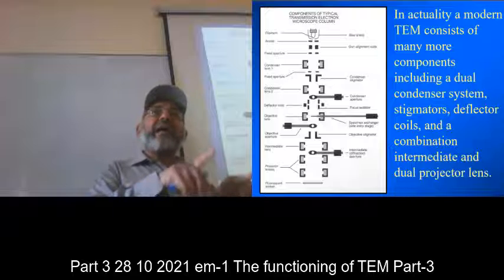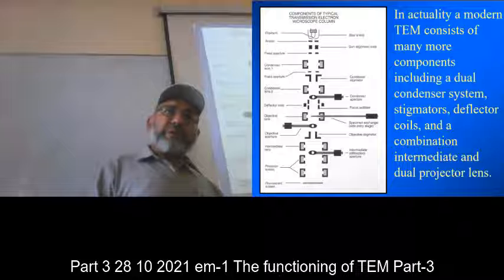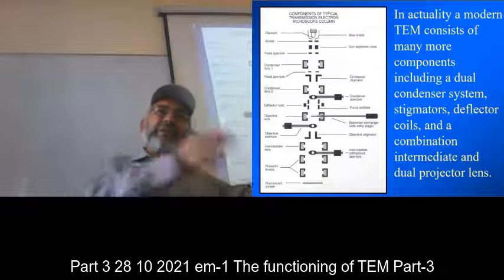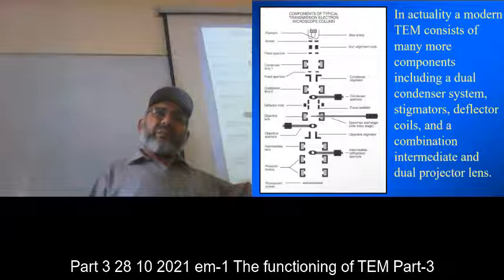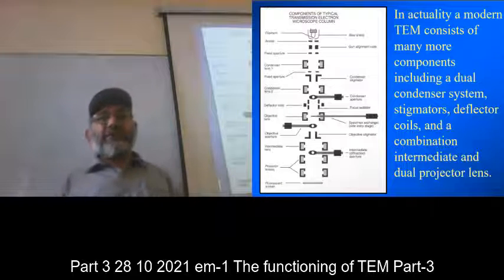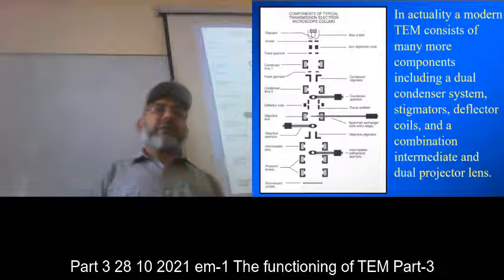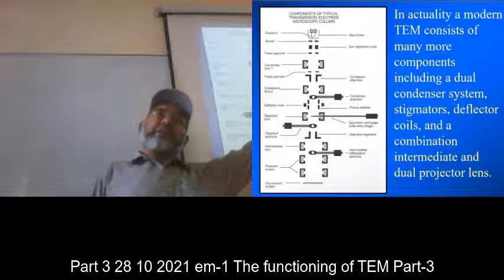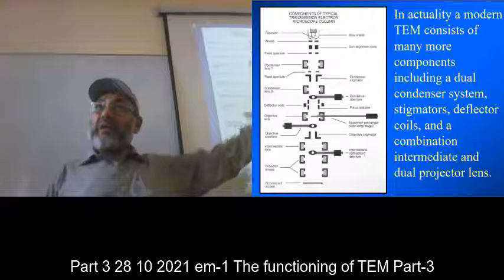That sort of microscopy is called high resolution microscopy. When you are moving into higher resolution, the diffraction pattern is done similarly in both cases. But when you are interested in atomic planes or in convergent beam electron diffraction, then you need high resolution electron microscopy to resolve fine features.